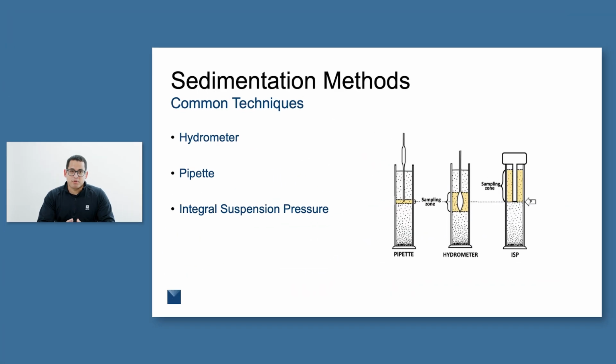And today we're going to talk about particle size analysis measurements, and we're going to focus on the technology and methods behind those measurements. Just to preface this, in a previous video, we talked about some of the fundamentals behind these measurements. And one of the things we really focused on is Stokes' law. And just a brief summary, Stokes' law allows us to relate the settling time of different particle sizes in solution to the particle size that we're trying to measure.